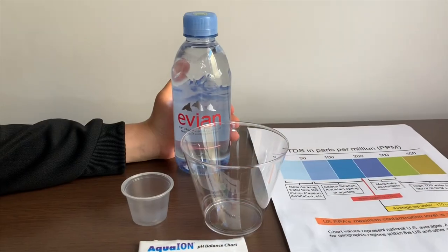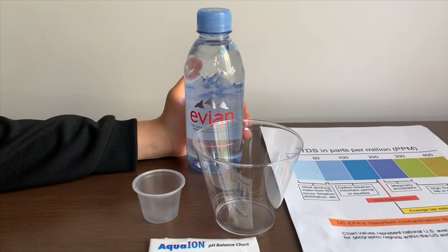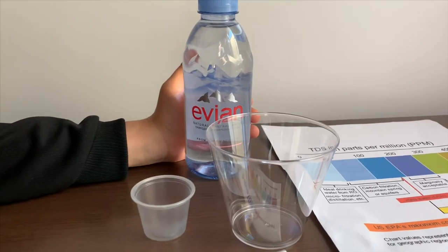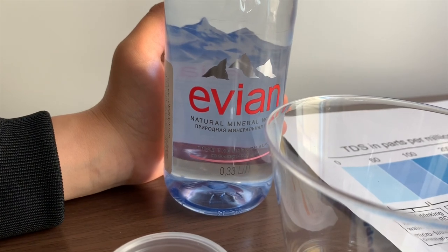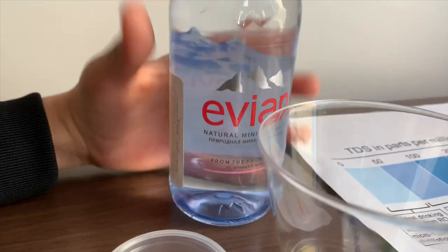This is Evian Natural Mineral Water. It starts from France and it's exported to Russia. The one we tested in the USA had a TDS of 176 and a pH of 8. Let's see how this compares.